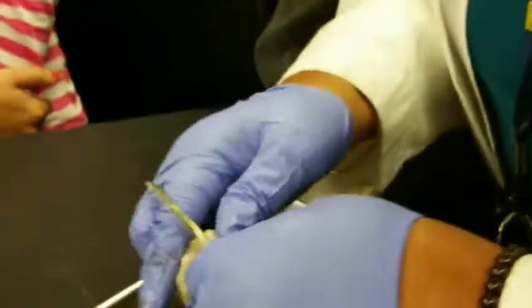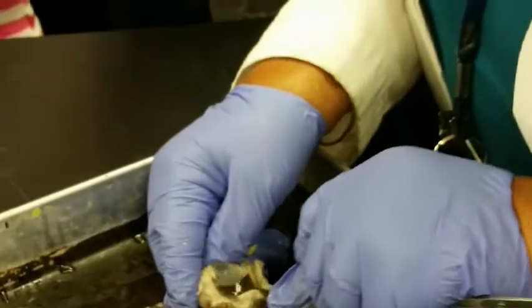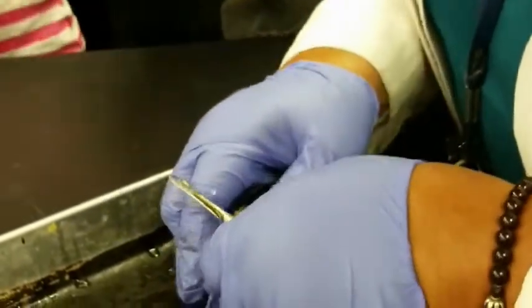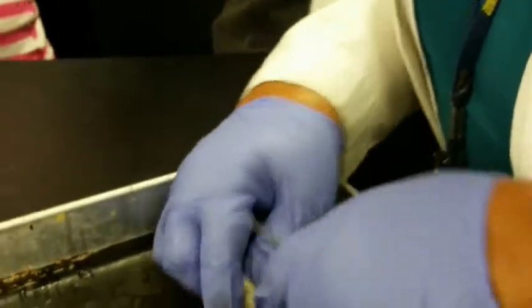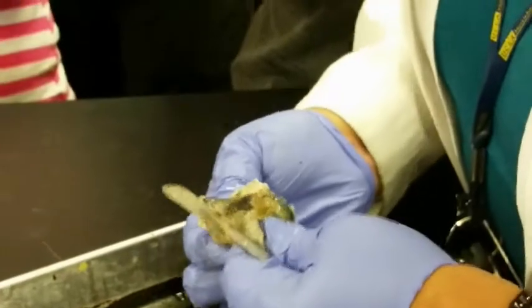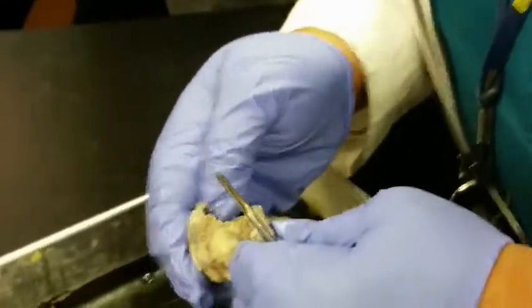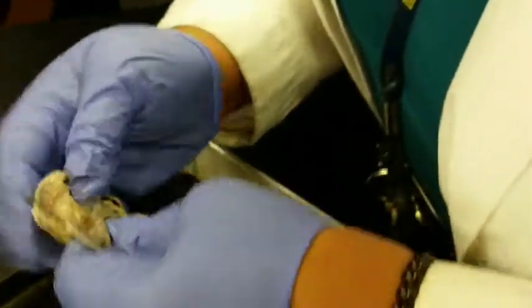So all that water is the aqueous humor. That's tough. Followed by the jelly-like substance, which is the vitreous humor. And that's the lens. Wow.